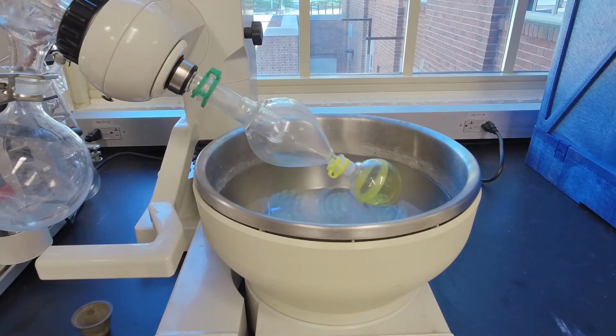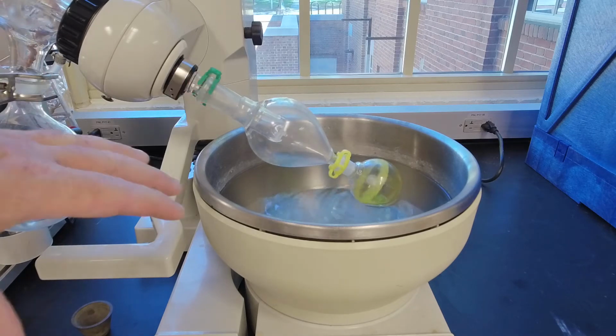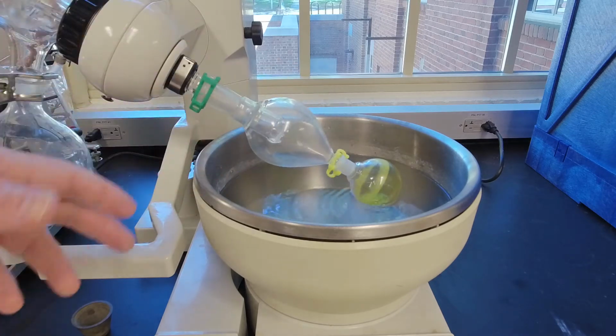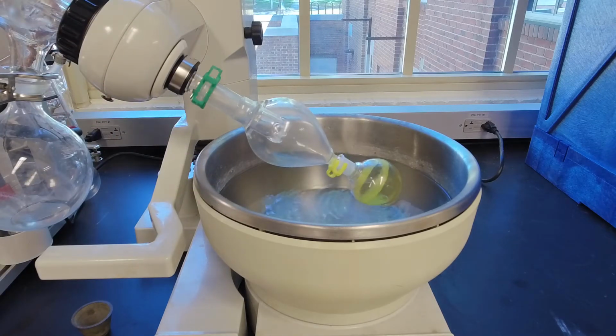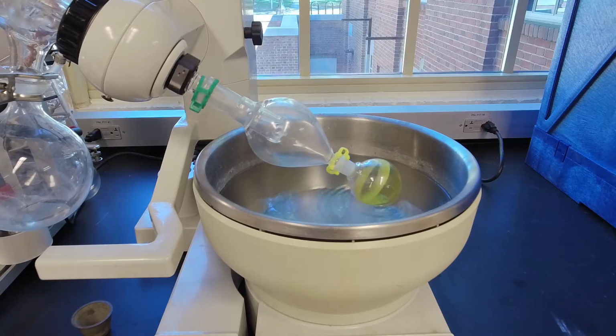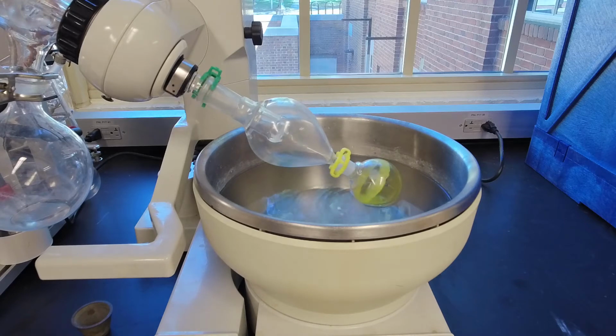we're going to be in a hurry. Everybody's going to want to go home. Your TAs, me, you, everybody wants to go home. But if you rush this, solvent bumps, you have to do it again. Or maybe you don't get rid of all of the solvent. Maybe you don't wait long enough and you pull some of your solvent into your pump and you damage your pump. So you always in the lab want to go slowly.